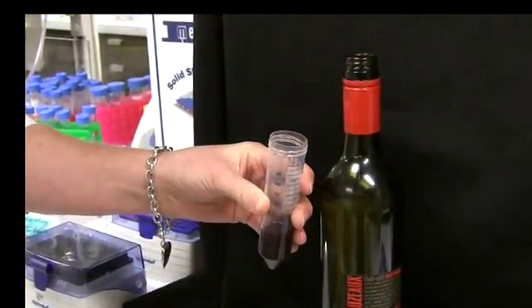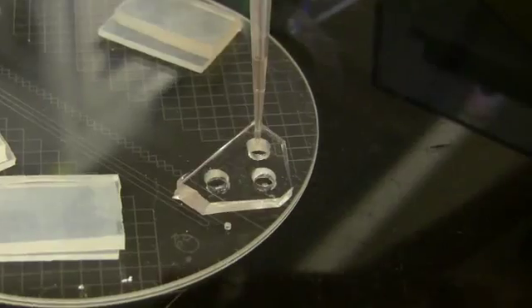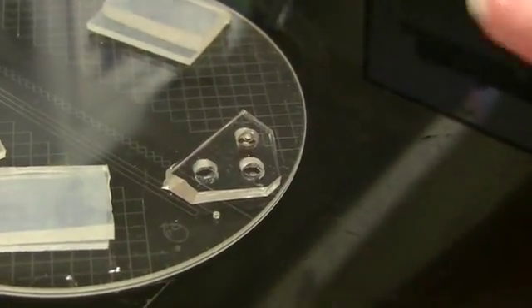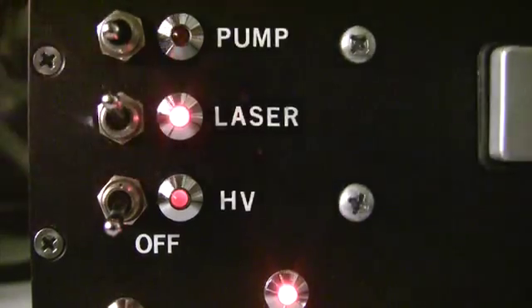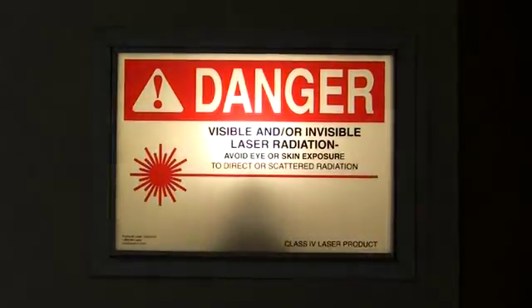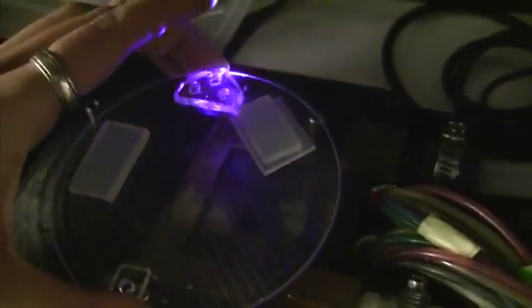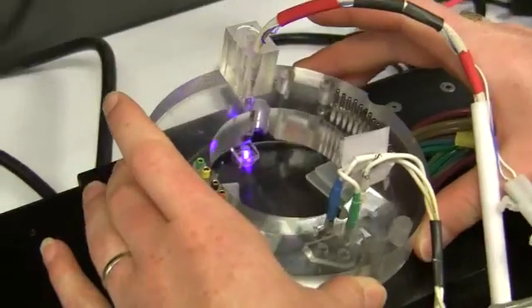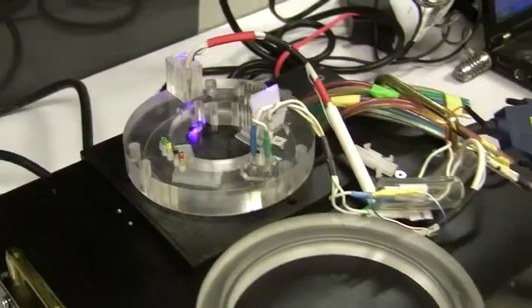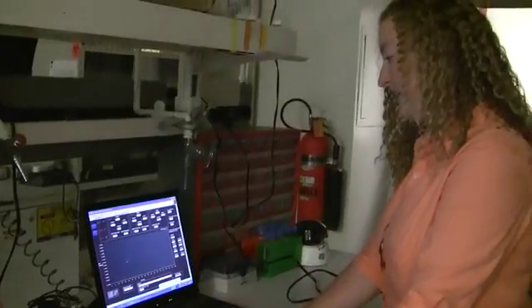To perform a test, scientists first put a few drops of the wine sample into the microchannel. The microchip is then put on the laser detection system to start the analysis. The operation is controlled and monitored by a computer. The result comes out in as quickly as five minutes.